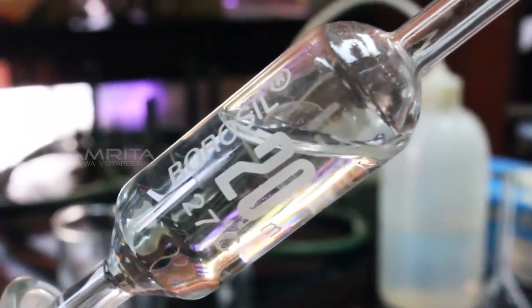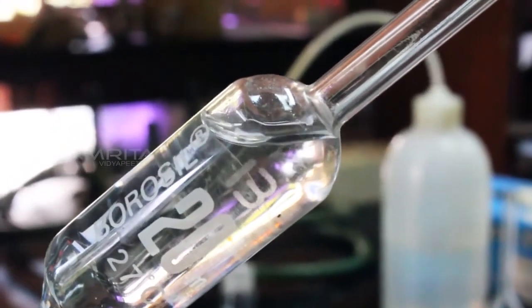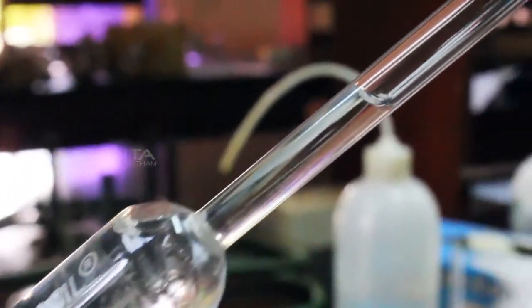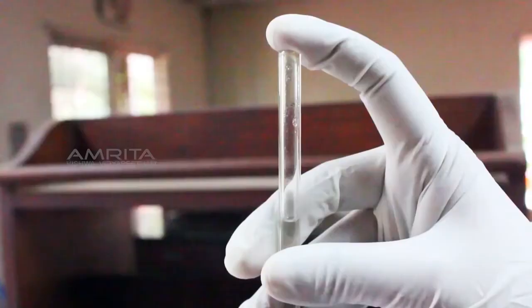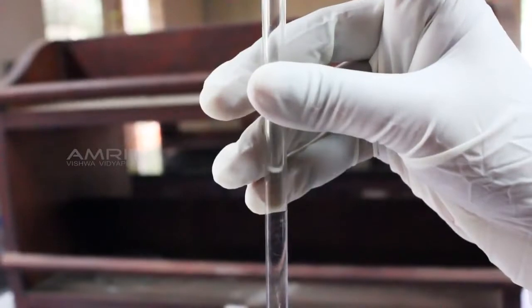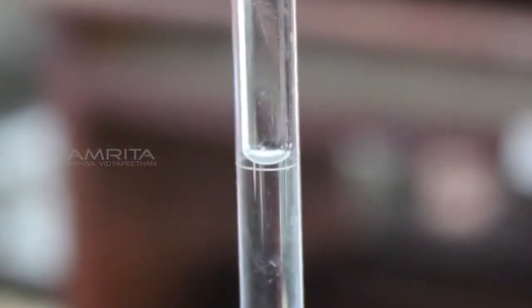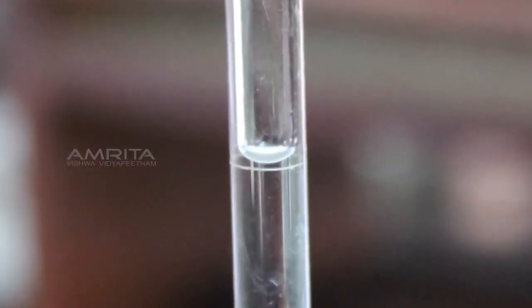Now, pipette out the sodium carbonate solution from the standard flask until the solution level is just above the calibration mark on the pipette. Close the open end of the pipette with the index finger. Slowly release the finger so that the solution is allowed to run slowly until the lower edge of the meniscus just touches the mark. The volume of the solution should become 20 ml.